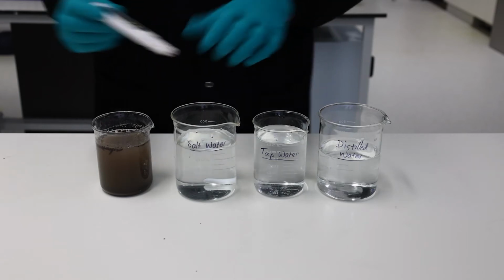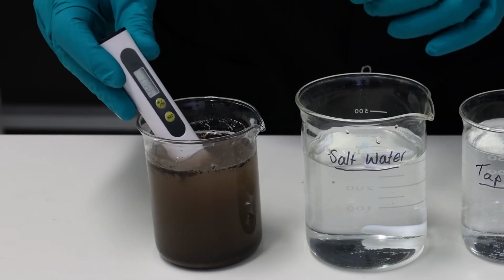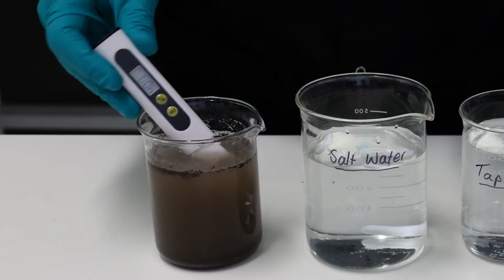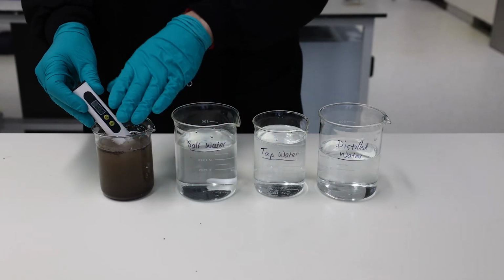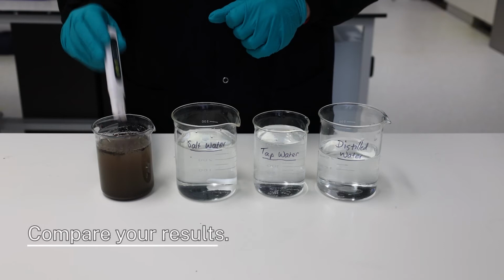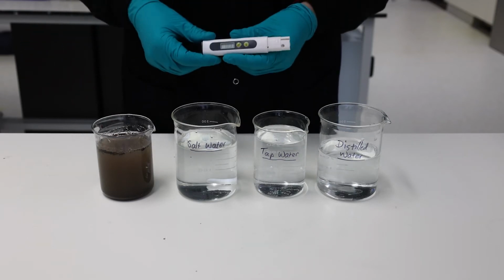What about this soil dissolved in water? We get a lower reading of about 450. So even though this water looks much cloudier than this salt water, it actually has a much lower dissolved concentration. Compare the results of the test and work out what water has higher conductivity and therefore more dissolved material.